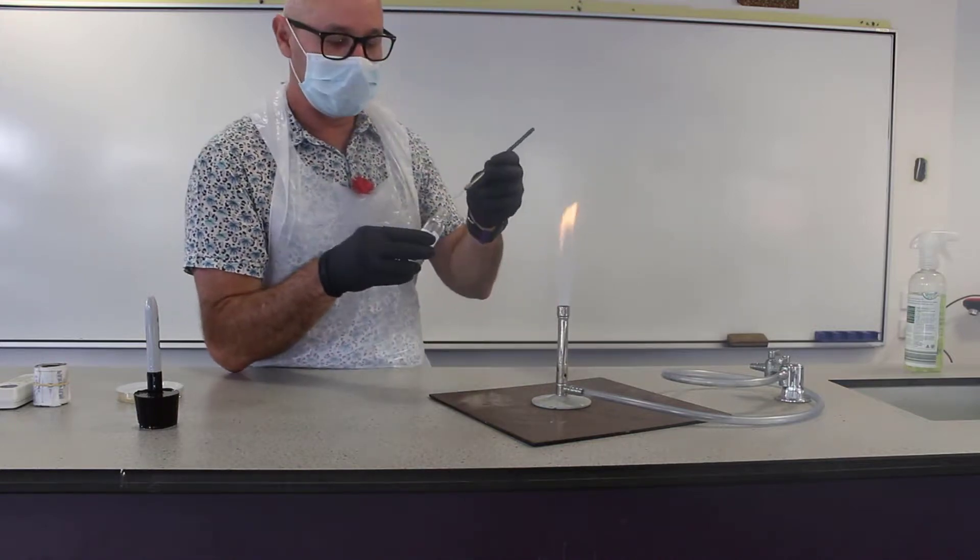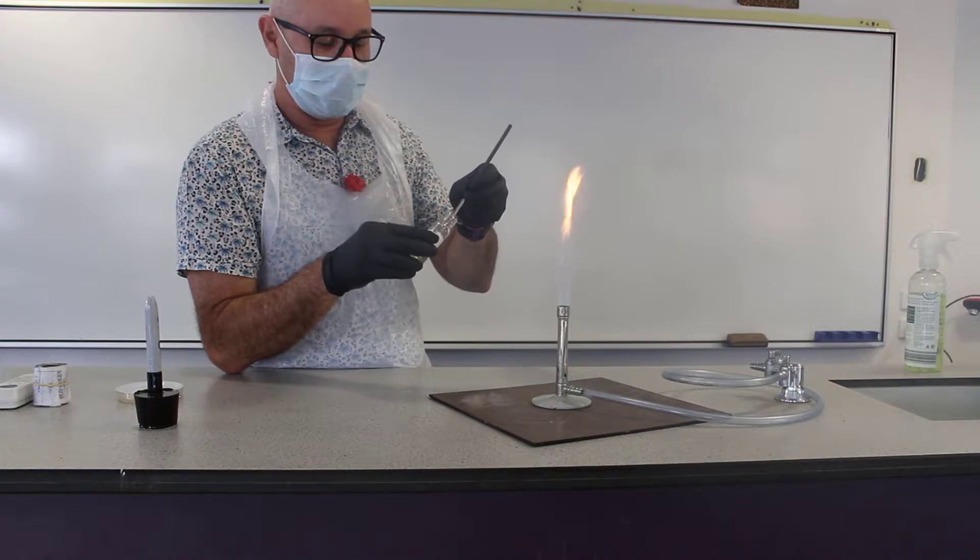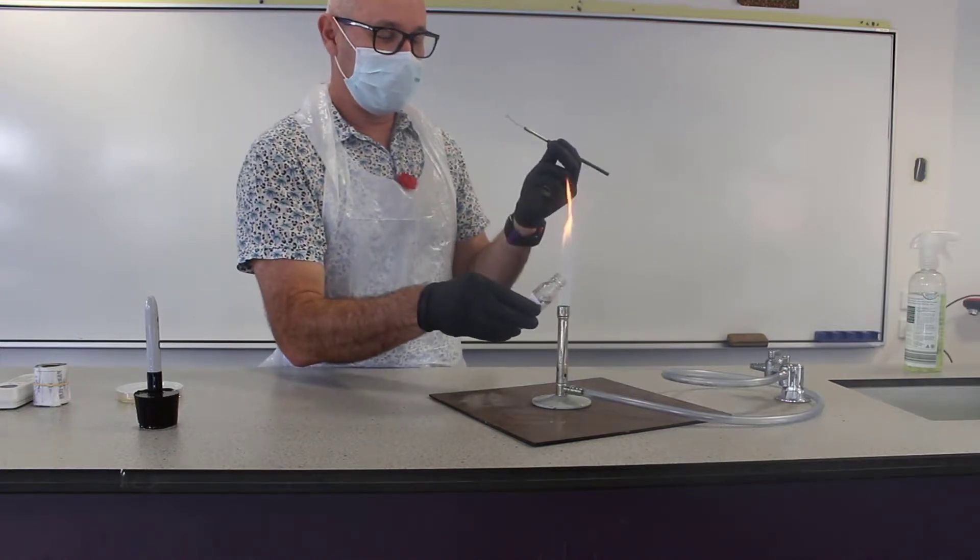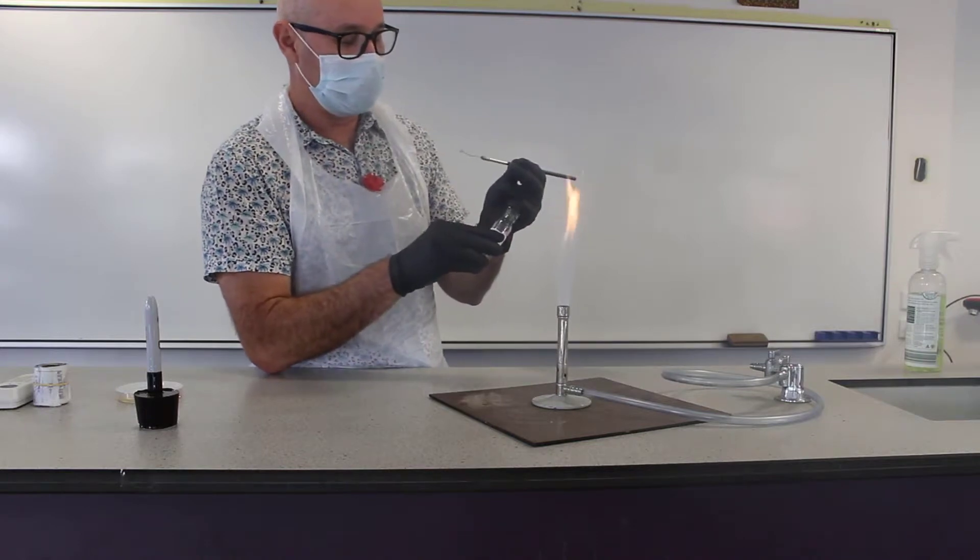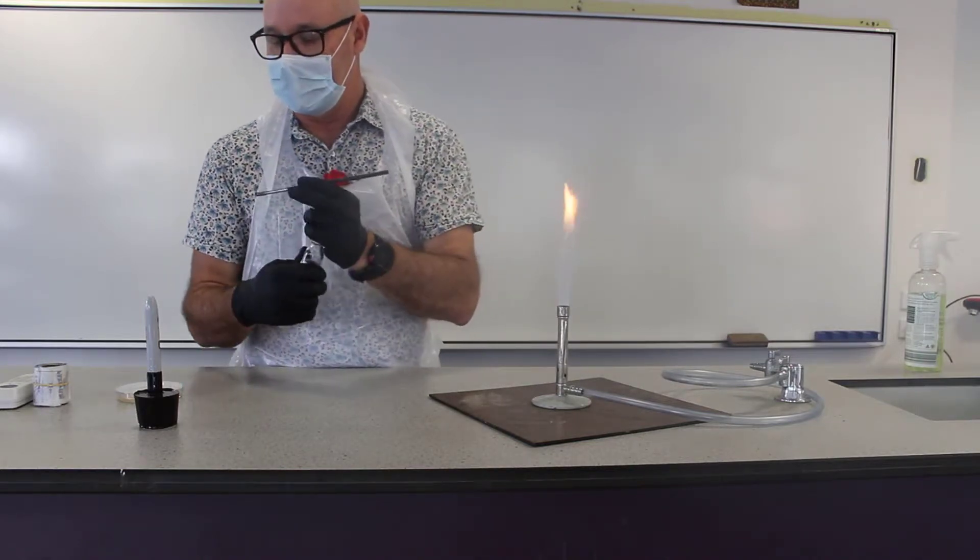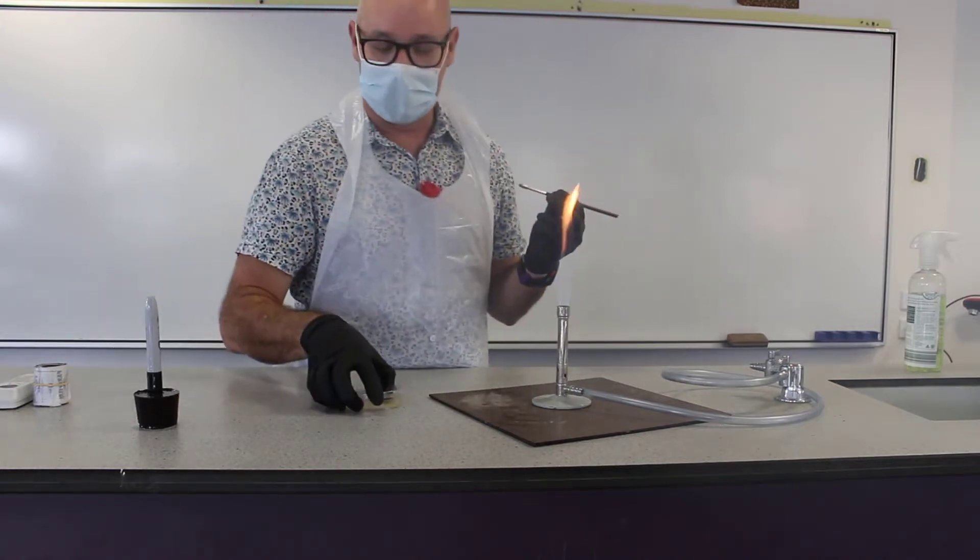Now we're going to put our loop inside the broth, take it out and we'll flame the jar again, then put the lid on. And then we put this out of the way. Now we're ready to inoculate our plate.